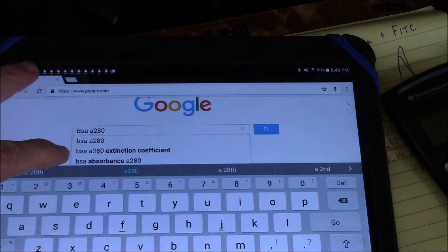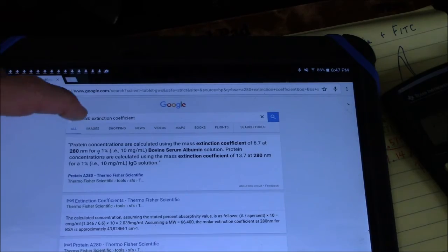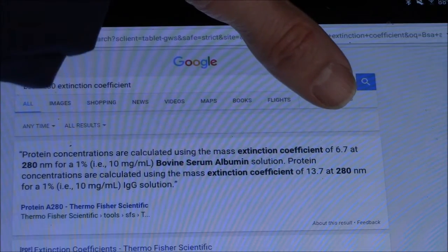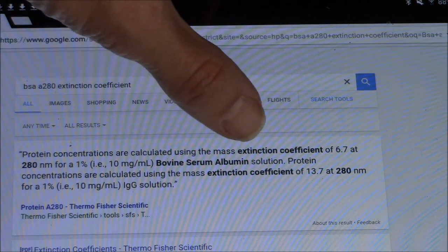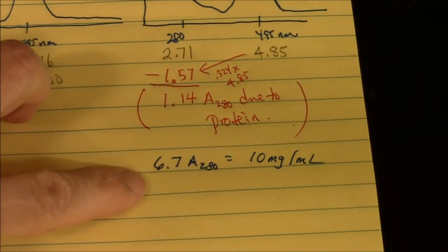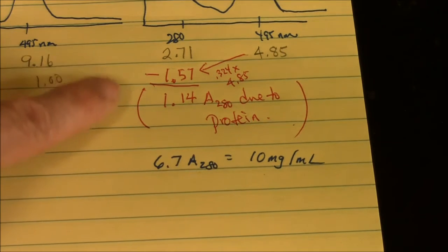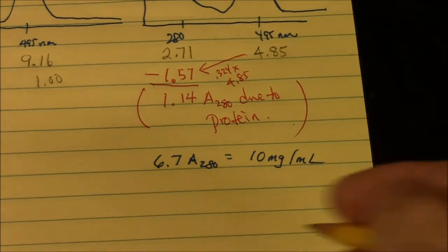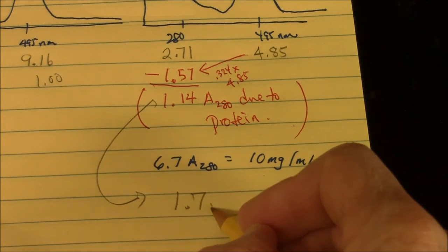The protein we labeled as BSA, so I'll search for the extinction coefficient at 280 nanometers. This one, it looks like a reliable source here. It's Thermo Fisher. Here it's saying an absorbance coefficient of 6.7 at 280 nanometers for a 1% 10 mg per mil solution of BSA. You should see that we can just do simple proportional reasoning. If 6.7 absorbance at 280 equals 10 mg per mil, this is about one sixth of that. So I can calculate that more exactly. So my calculations say that this is equivalent to 1.7 mg per mil.